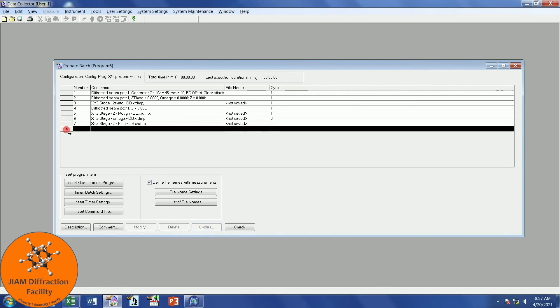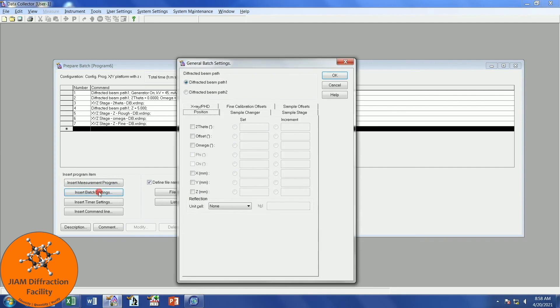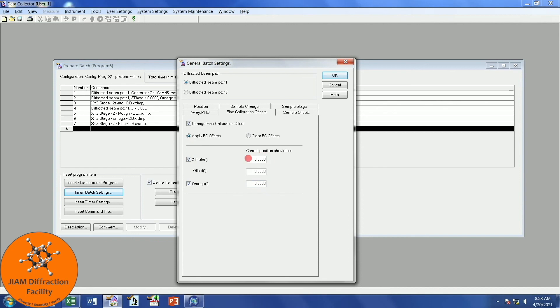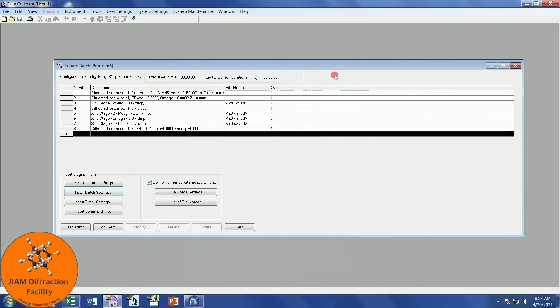Click down here on the last row, and then we will insert Batch Settings. We will go to our Find Calibration Offsets, change them. This time, however, we want to apply offsets. We will put a check mark by left-clicking next to 2 theta and Omega. Make sure that they are both 0. That will save the offset that the program has determined. Click OK, and you have now created your batch program for alignment.